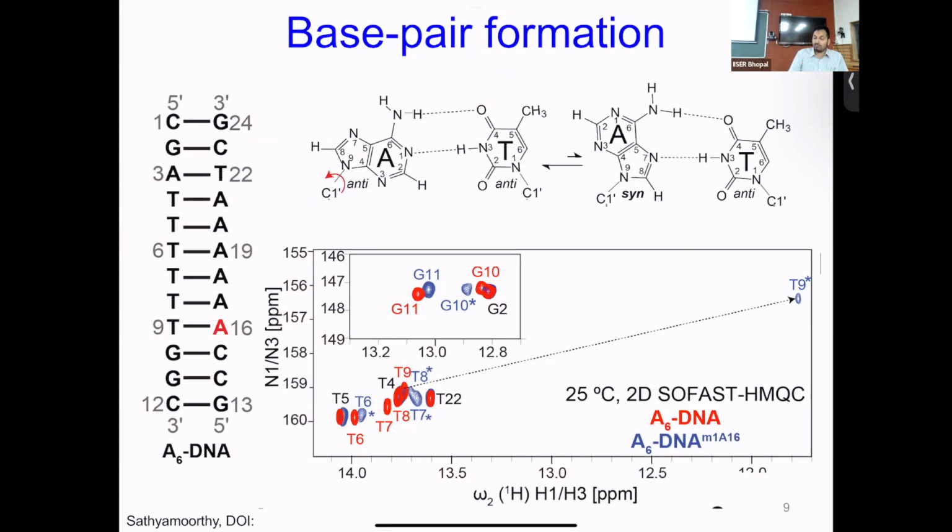Instead of protein, it's an example of a DNA duplex where every resonance is assigned. So for instance, you have G11 here, the G11 assignment is shown like this, versus where G2 and G10 are in separate, different places. Because this is sequence-specific assignment, you know which resonance belongs to which part of the biomolecule. This is important because then you can see the atomistic changes that happen in that given molecule when you add a drug and when you make it unfold, right? Protein-protein interactions, protein nucleic acid interactions, all that can be studied.